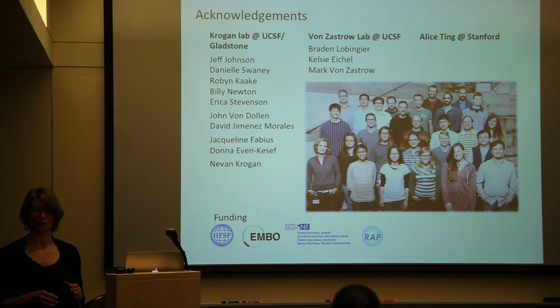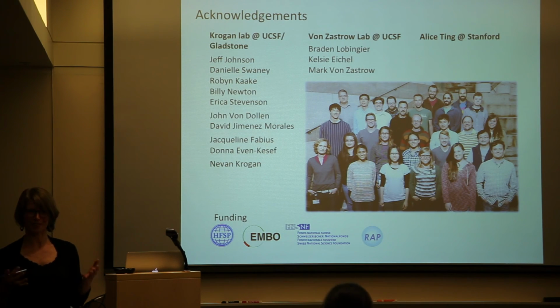However, all of this depends, of course, on the sample input. You use the same sample as input, and if they are not normalized very well because of total protein amount or something, the quantification will be similarly off.